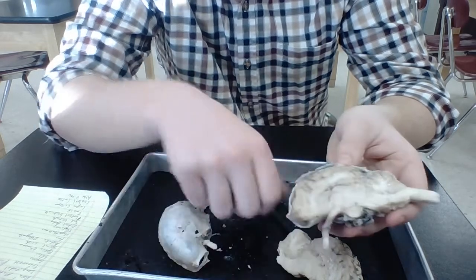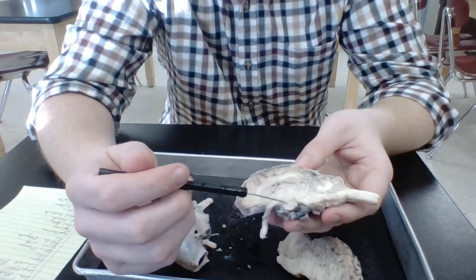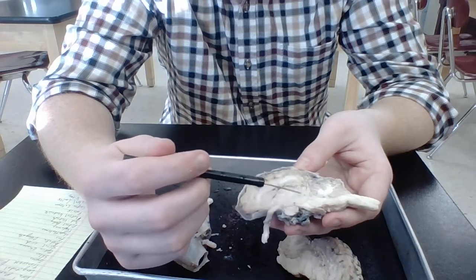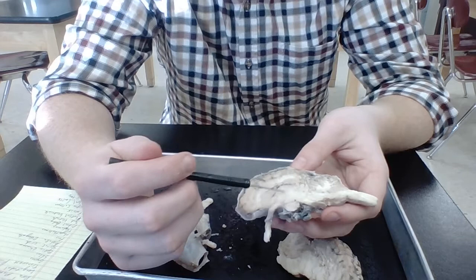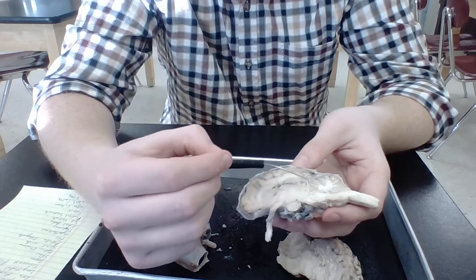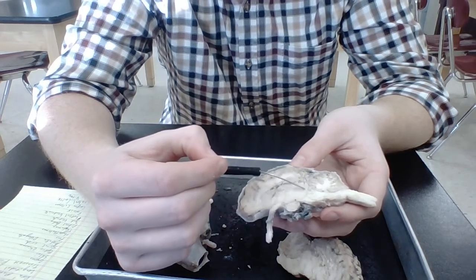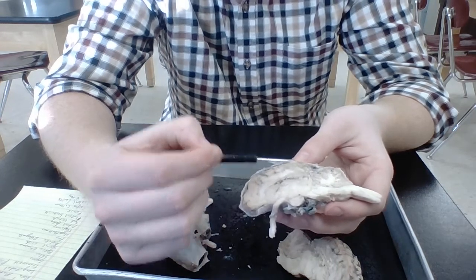All right. Then we're going to get to the hypothalamus, and your hypothalamus is kind of down here, and your thalamus is right about over here. All right, so the hypothalamus is a little below that. Together these make up the limbic system. Then over here, there's this little thing right here that juts off from the thalamus. This is your pineal body. That's where your pineal gland is located.